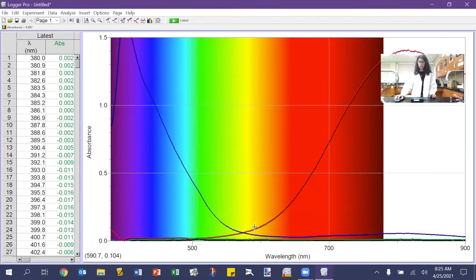So what I want to make sure to do is pick a wavelength over here because the absorbance of both my iron and zinc are at a minimum, whereas the copper is absorbing highly. And so that way, if there is any iron impurity in my brass, I don't need to worry about that artificially increasing the absorbance of my samples. So looking at this, I'm probably going to pick a wavelength around 600 nanometers because again, that's where I'm seeing a minimum absorbance of my iron 3+ and my zinc 2+, but I am seeing a good absorbance for my copper solution.